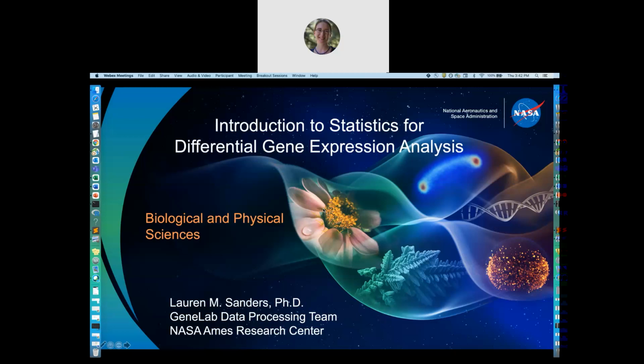So if you get a gene that is expressed with 1 count, we don't care about that. That gene isn't doing anything. It's not really biologically active. It could be a technical error. In fact, it probably is a technical error.